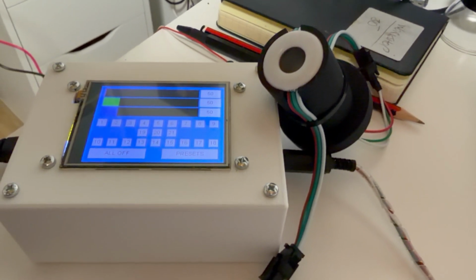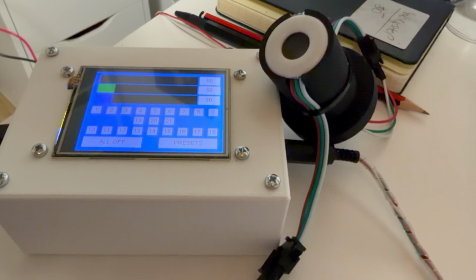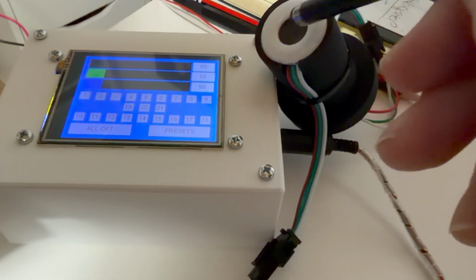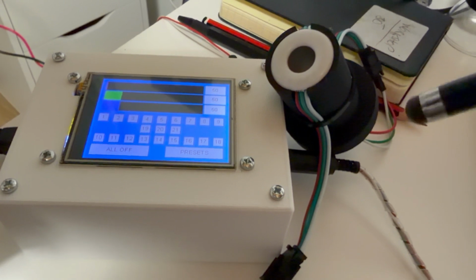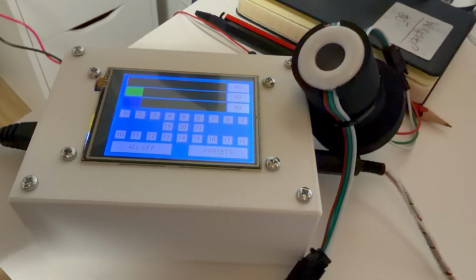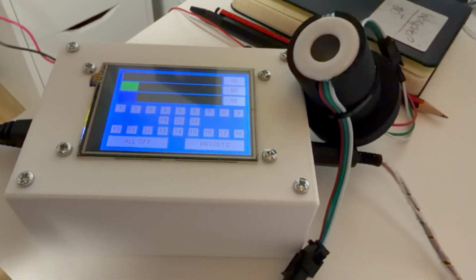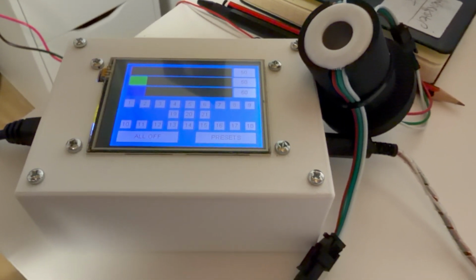So this is the condenser off the microscope. The Nextion display allows you to set any color of any pixel within both the outer ring here and the inner area here. I call this thing a LuciLED condenser because the central bit acts a bit like the old Zeiss condenser that didn't have any glass. It was simply a light that illuminated a milky white piece of plastic, and that was called Lucigen, so hence LuciLED. So you can set the color of any pixel.